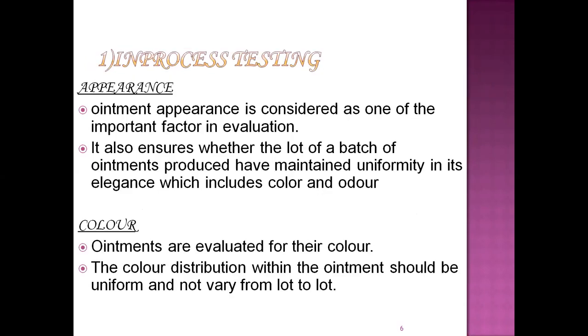In-process testing now. One is appearance. The appearance of the ointment is considered one of the important factors in the evaluation. It should also ensure that the lot or batch of ointment produced has maintained uniformity in its elegance, which includes color and odor. Then the color: ointments are evaluated for their color, and the color distribution within the ointment should be uniform and should not vary from one lot to another.